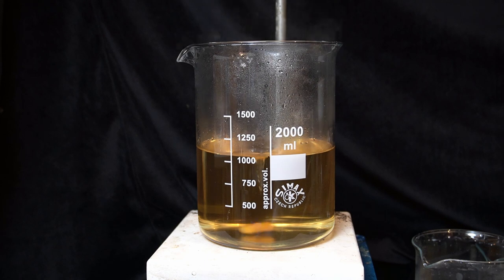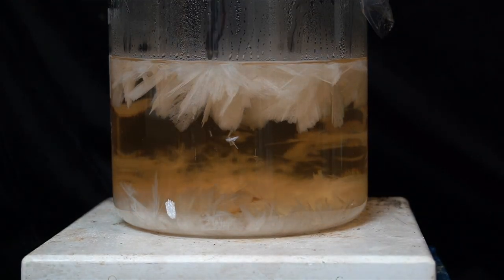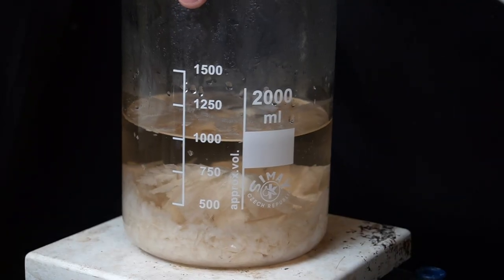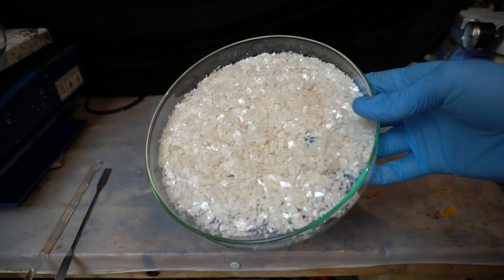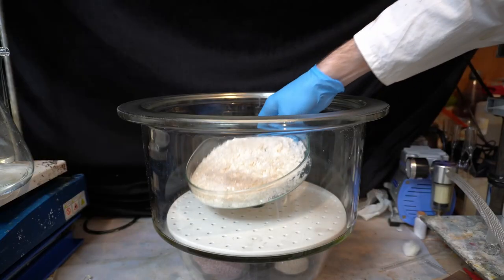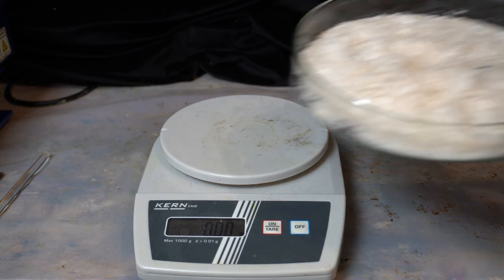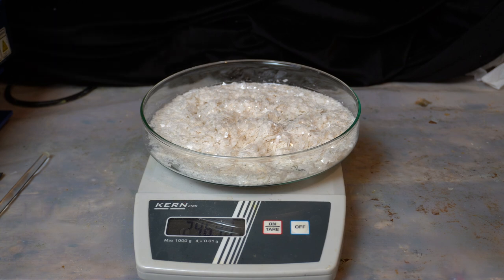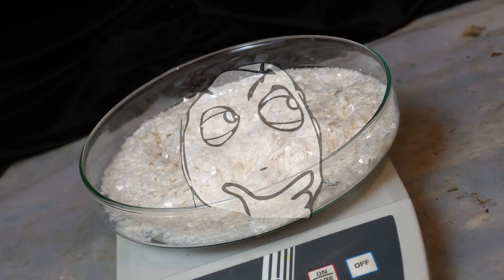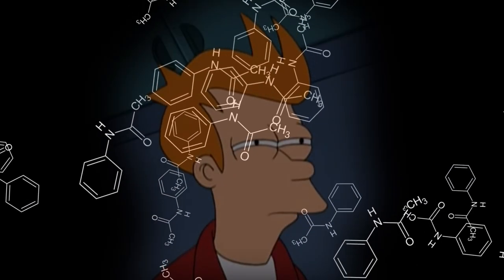Now that everything is dissolved, I turn off the hot plate, cover the beaker with some plastic wrap, and let everything cool overnight. After leaving the beaker in the fridge for another day, everything has crystallized and the solution is filtered again. The crystals are now completely white and fluffy, but still wet, so to fully dry them I put them in my vacuum desiccator. The next morning the crystals are completely dry. The recovered product has a mass of 52.42 grams, which corresponds to a 77.56% yield — not exactly great, as it should usually be above 90%. There's still a whole liter of mother liquor, and I'm very suspicious that a few more percent yield is still hiding in there.